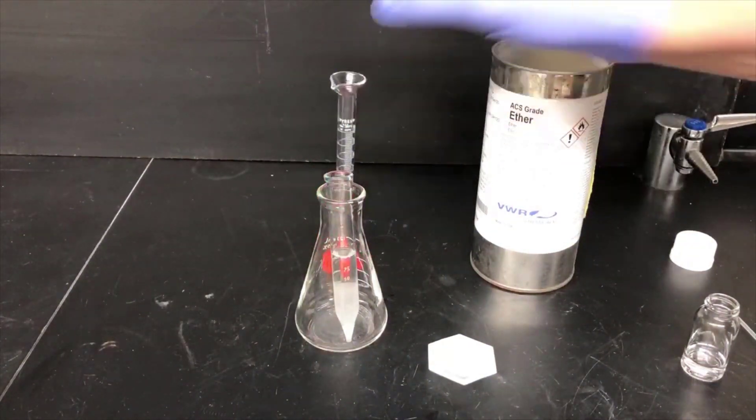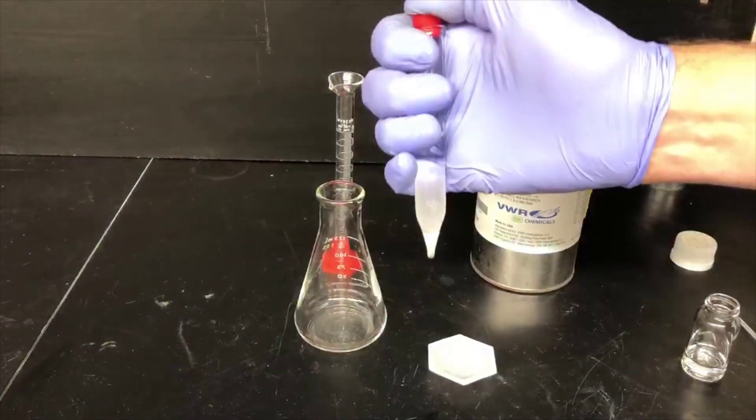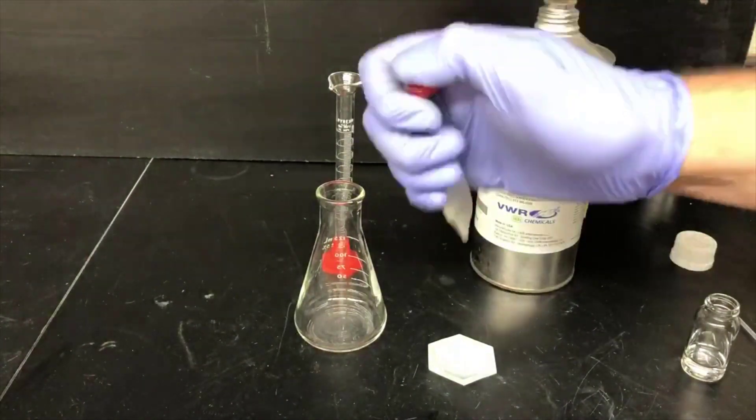I'll cap that vessel, and I'll give it a shake. This is doing an extraction. The cyclohexanone is going to migrate into the ether layer.